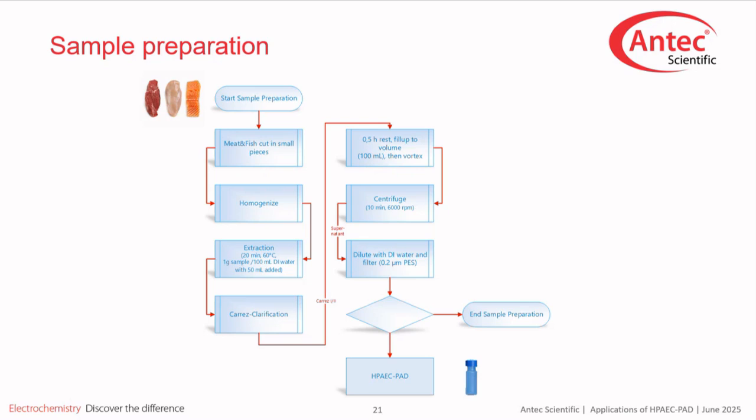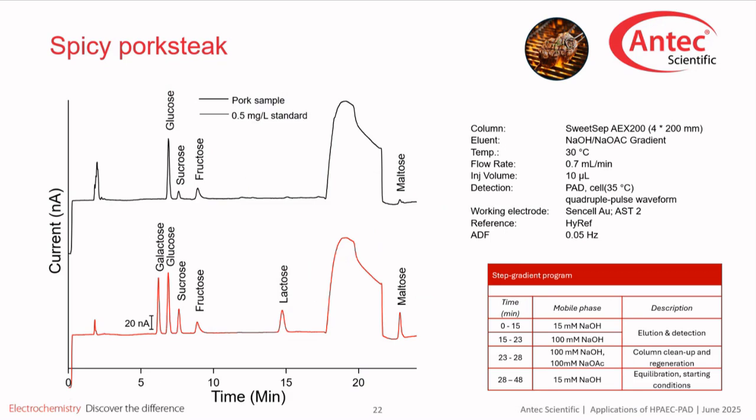Processed food samples came with different sauces in which the pork, chicken, and fish were marinating, adding complexity to the analytical method. So, as discussed, we removed the proteins and fats, diluted the sample, and then injected it. You're already familiar with the process.